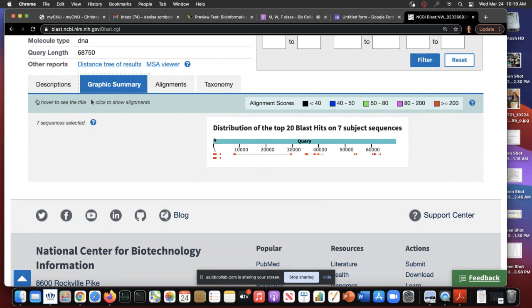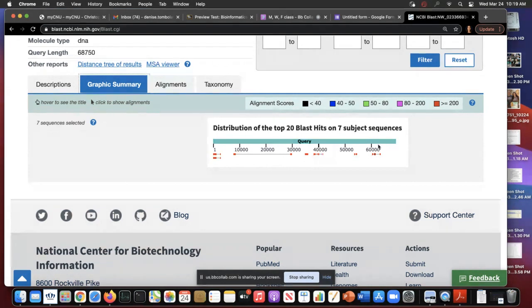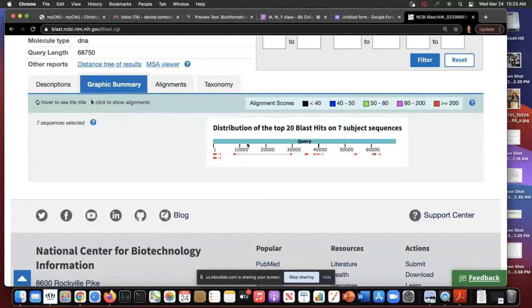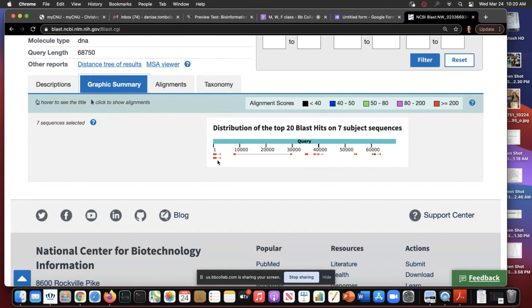One gene here, a second gene here, a third gene over here. A fourth gene here with a bunch of parts that either don't align or they are introns. Another gene here and one here. The way you are going to count this is how many columns basically are matching the mRNA to the genomic sequence. And if you have different rows, there would be more mRNA molecules that match that same spot. But in that spot, that's one gene. And this would be different alleles.